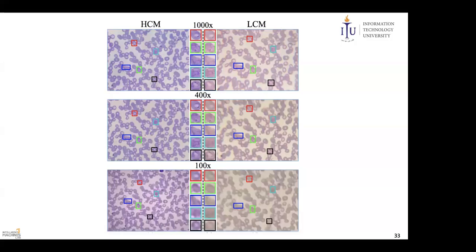So the same area is captured by the low quality microscope, even with the same imaging like mobile, but on the high quality microscope you see the big image. When we put the mobile at the same location, if you see the first image here, this area is not in the low quality images.